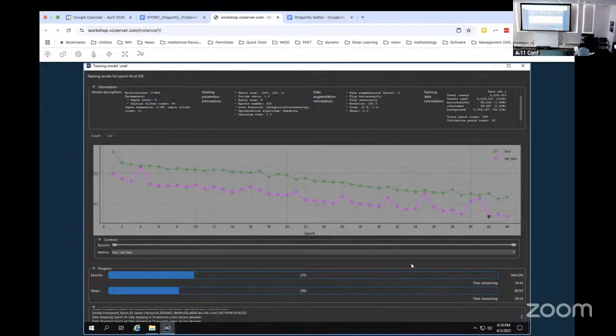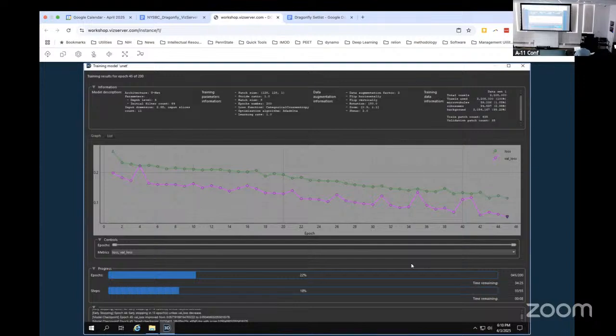Yeah. So all anything that's this input data. But it's like, that still might be good enough. Last, so this is good, actually check. I did like this myself. Yeah. What roughly is the y-axis? What's your loss? It's bad. Okay. For all metrics, a higher score is a higher loss.